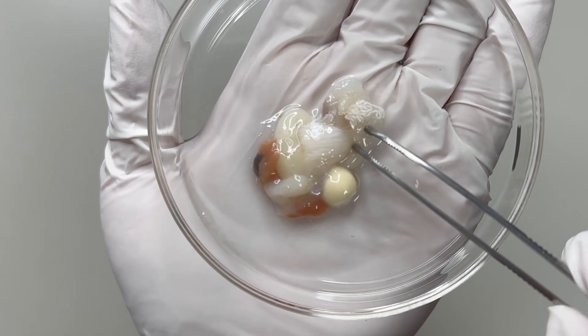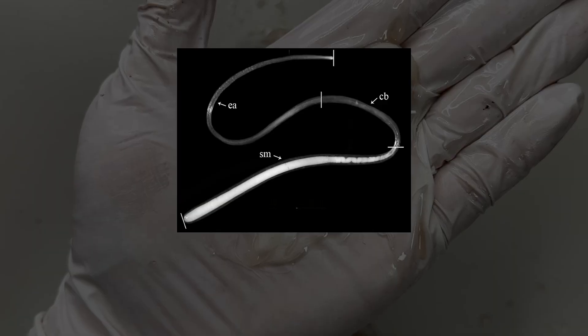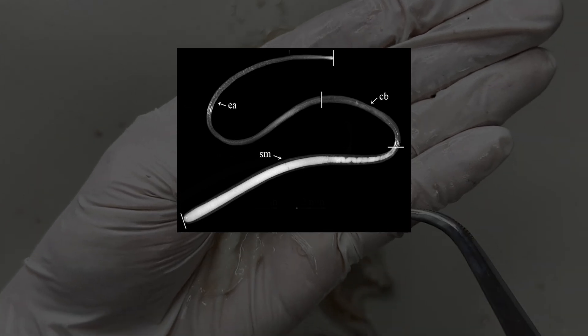Next let's cut open the male reproductive gland — these stringy things came out. This string-like substance is sometimes mistaken for parasites, but it's actually a sperm packet filled with sperm. Webfoot octopuses release sperm in these packets.